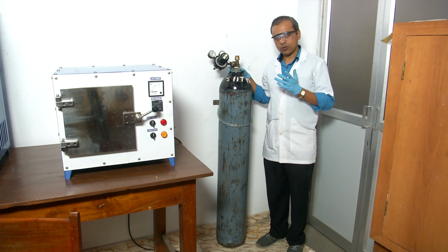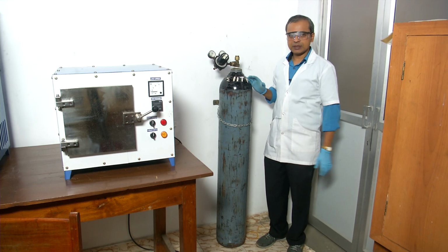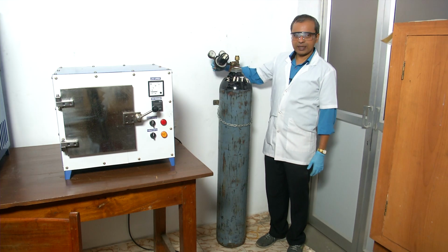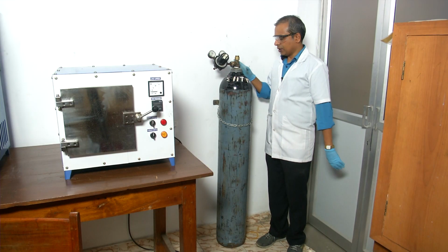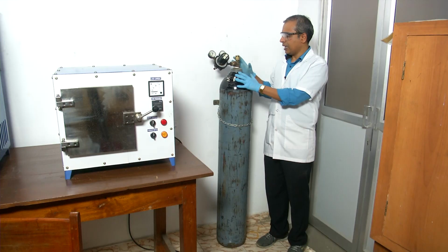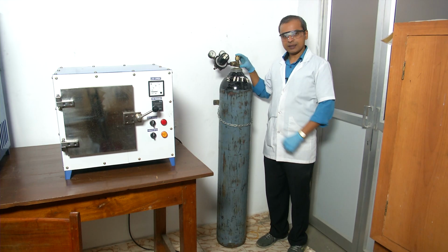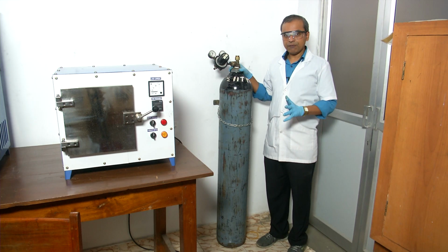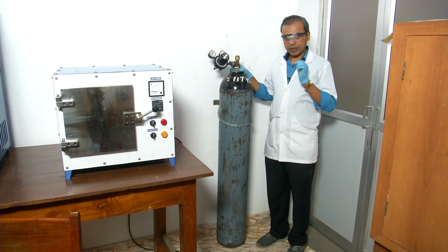The point that we need to pay attention to when we are dealing with a gas bottle is that this is a structure inside which there is pressurized gas, and to access the gas we put a regulator on top of the gas bottle, and this is the neck, so to speak. Once you put the regulator, the neck is in a delicate situation, meaning if the bottle were to fall, there is a great chance that the neck can break. If the neck breaks, the gas can come out in an uncontrolled manner, and then it is a very dangerous situation.